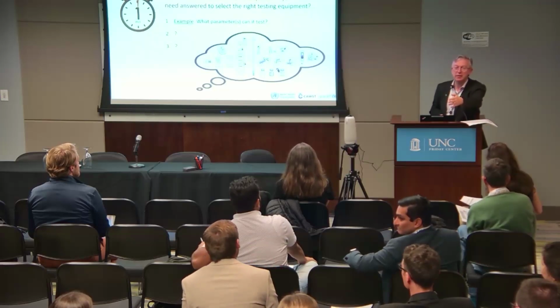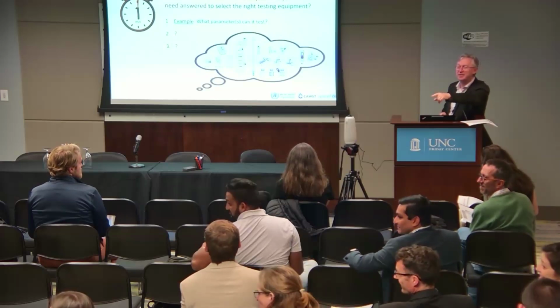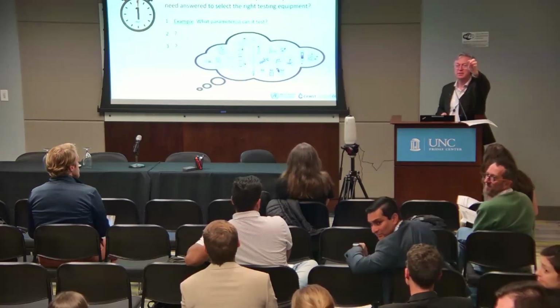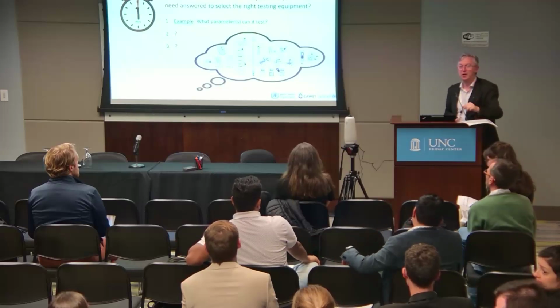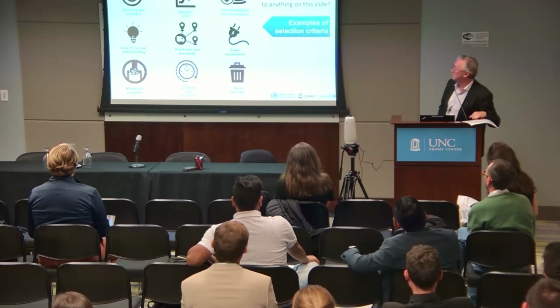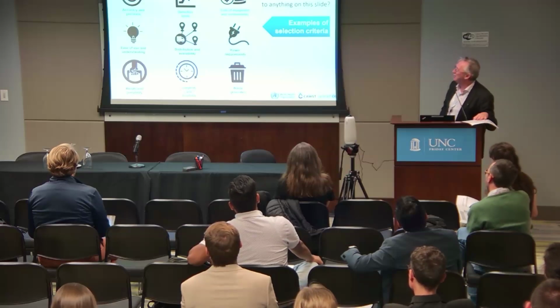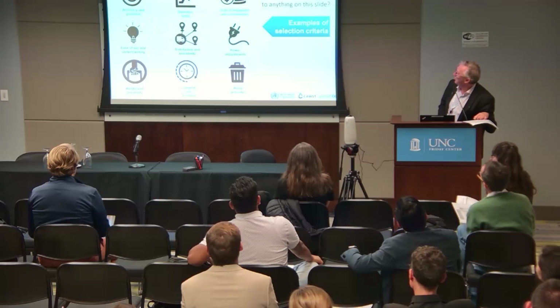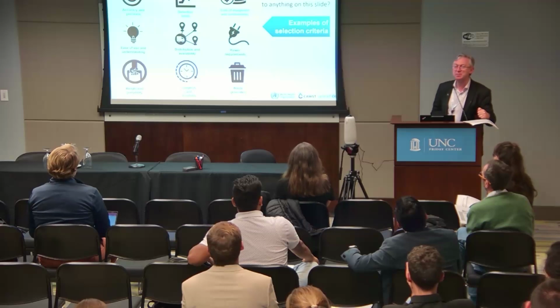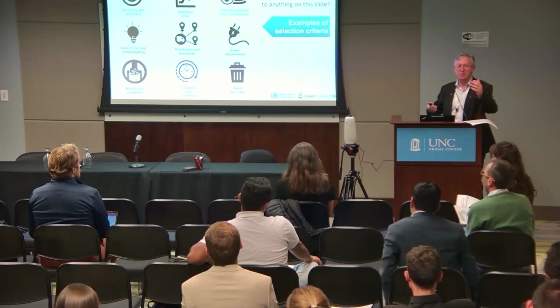So the level of skill, or how easy is it to mess up and get wrong? Skill set, there are other hands here. The duration it takes to get the results. Yeah. Is there any consequence to anyone if the test isn't conducted? Okay, so I think you touched on nearly all of these points, which was pretty good in the space of about 2 minutes. You got it all. Maybe the only ones missing were detection limits, distribution and availability, weight and portability. So a really great set of comments coming from you.